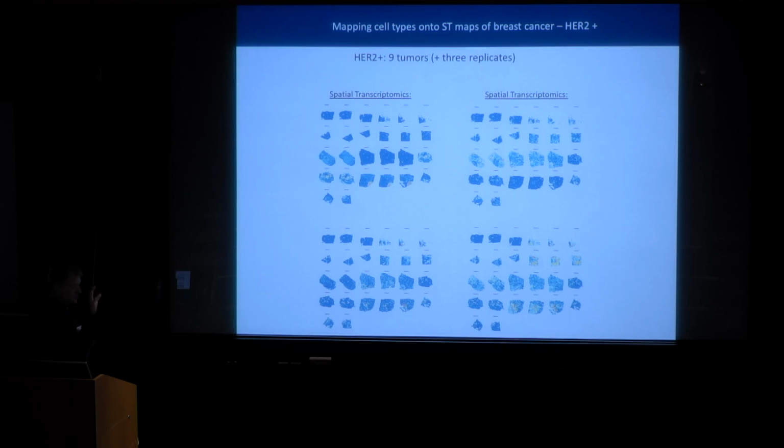So we could then do our ST experiments, and this is from some tumors. These are HER2 breast cancer tumors. I'm not focusing on any details here. These are triplicates of a number of patients and their tumors. We generate the ST data, but then we could link into the single cell data sets that have described how adipocytes look at the gene expression level, or the CD8 cells, or the macrophages. So combining these two, we could actually find where the different cells are.